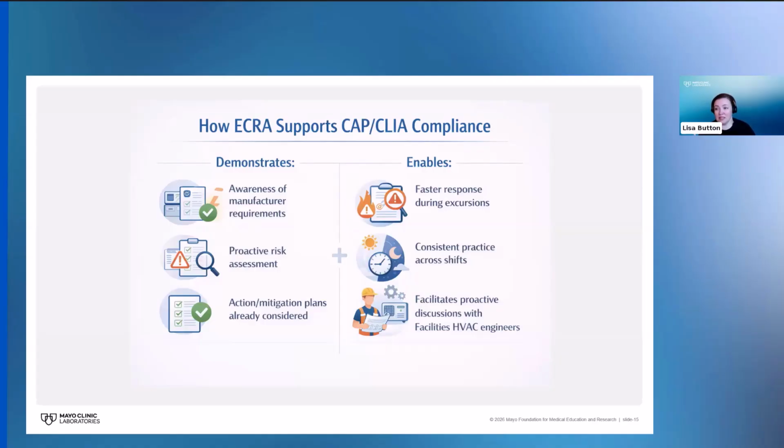We also think that it is going to enable us to have faster response times during these temperature or humidity excursions. It's going to lead to consistent practices across shifts because it's the same action plan of halt testing or send to a different lab or continue with additional QC during the excursion period, so that all of our shifts are going to feel empowered to make the same choice, the right choice.